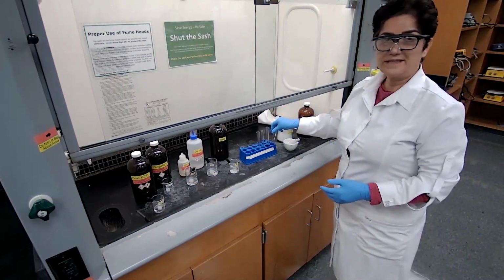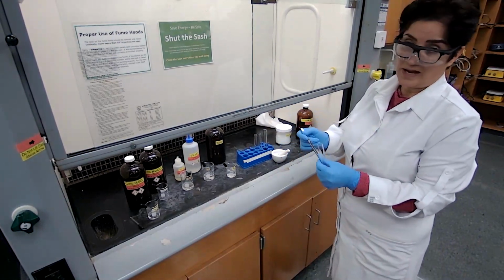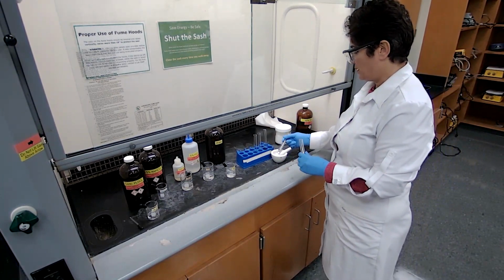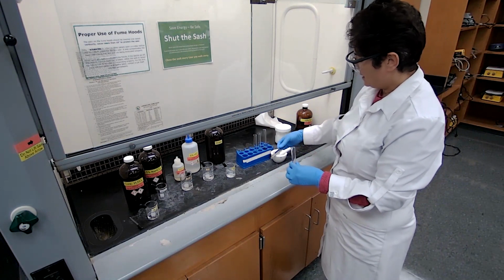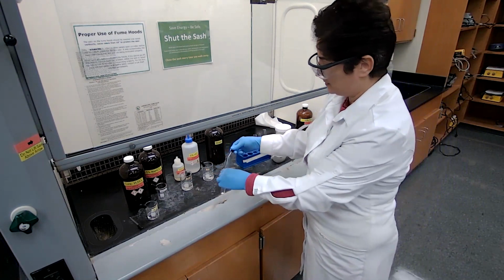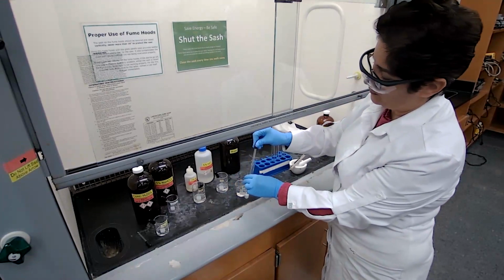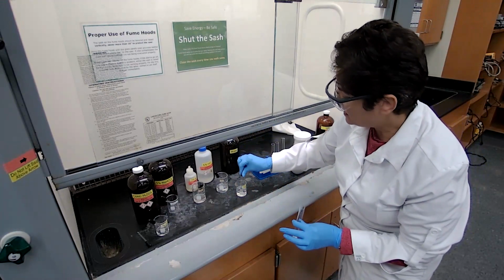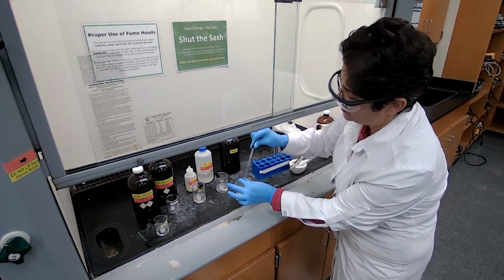We're doing the solubility test. For the solubility test, I use a tip of the spatula, as we have been doing, to approximate 0.1 gram of the sample, with 3 full droppers, again to approximate 3 milliliters of the solvent. For a full dropper, you squeeze the rubber bulb completely, release it in the liquid, and remove it when it's full, and transfer.